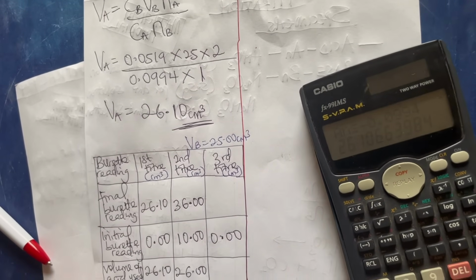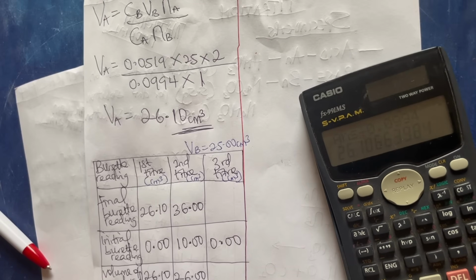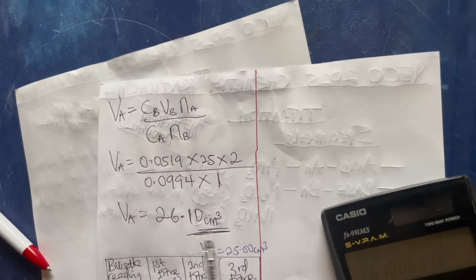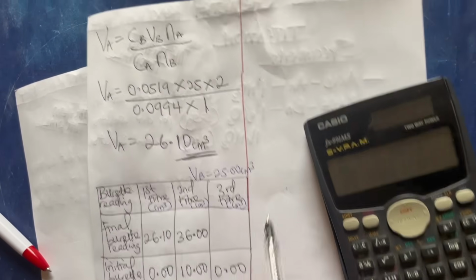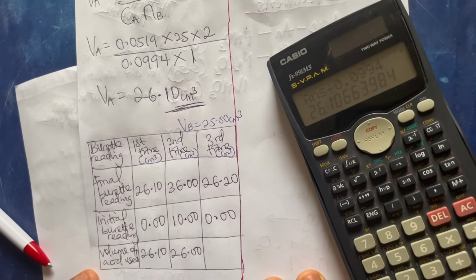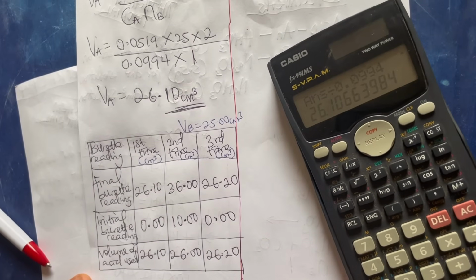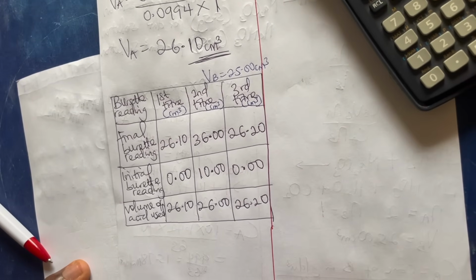Since I want to balance it to be 26.10, let me give here as 26.20. So here can now be 26.20 as well. Good, this is very perfect.